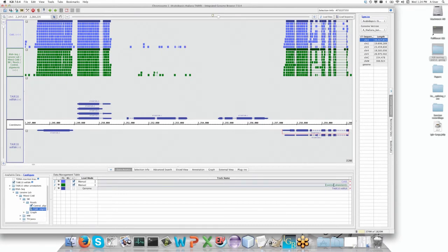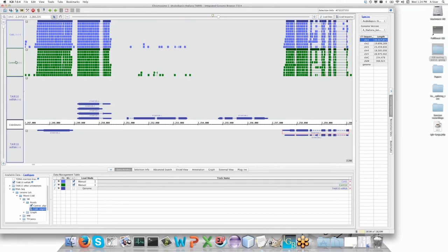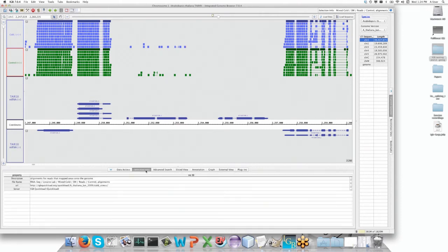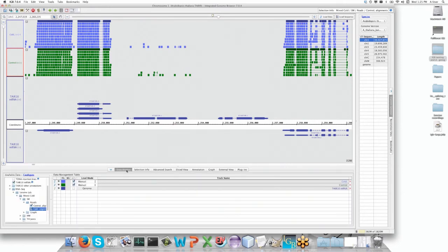Now IGBI doesn't forget where these came from. You can still find out where that file came from by selecting - that is, I click on the name and I go to Selection Info, and it tells me where I got this file from. So now I've adjusted the names, but there's still quite a few other adjustments I'd like to make.